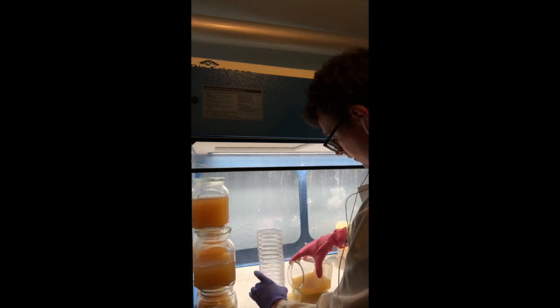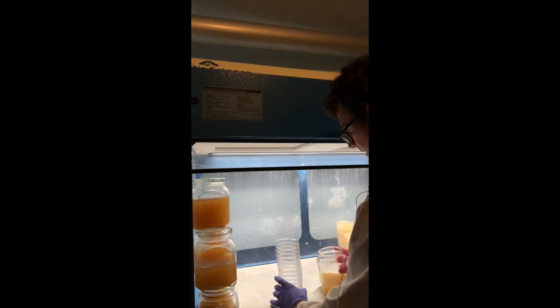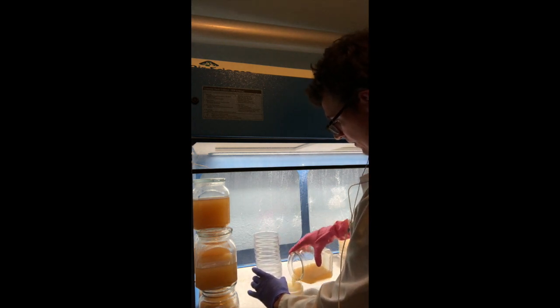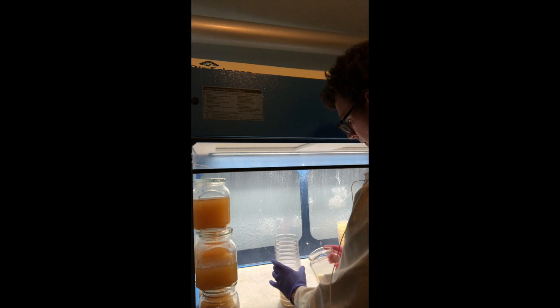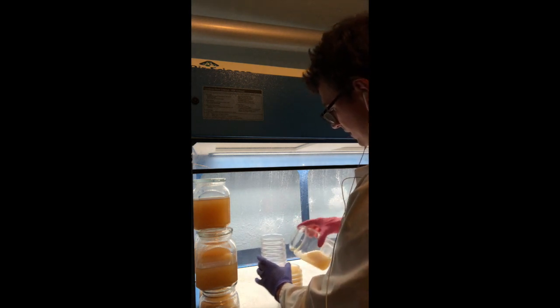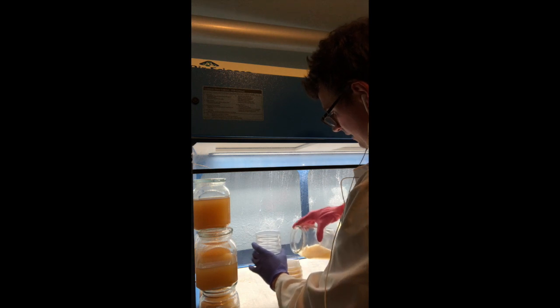So an alternative approach to pouring plates spread out is you can stack them and pour them. So essentially you just want to start from the bottom. Pour. And then just work your way up to the top. So this is nice if you have a horizontal hood, or a vertical hood, because the top plates are going to be the most sterile anyway. The only downside is you end up with a little bit more condensation.